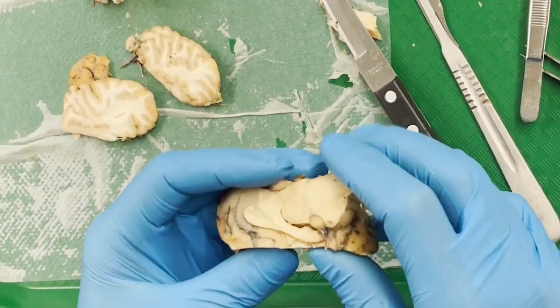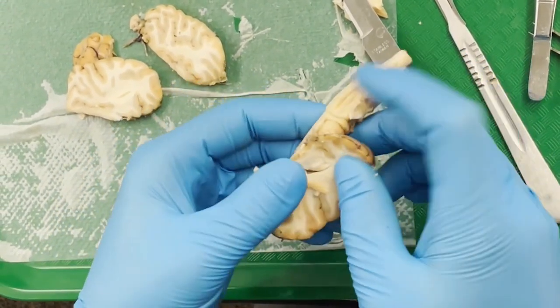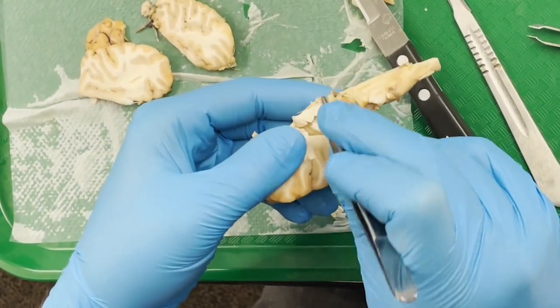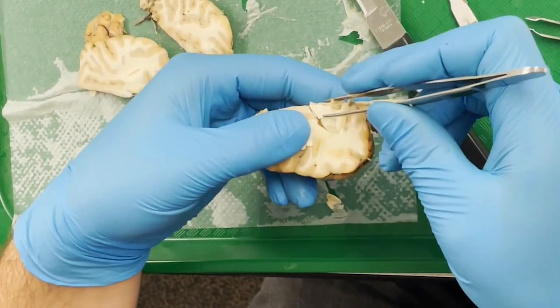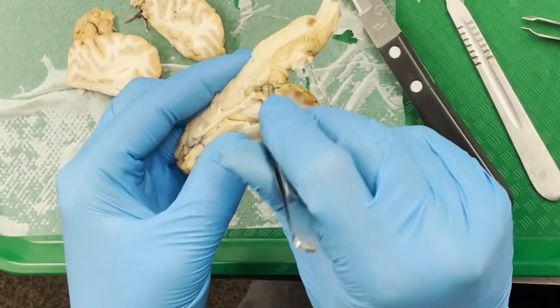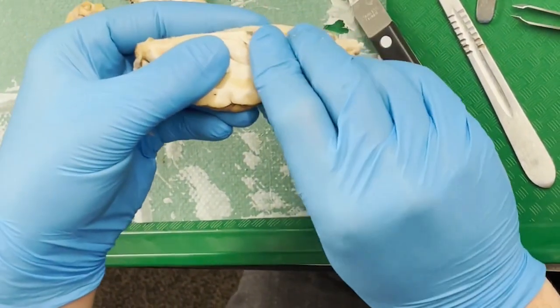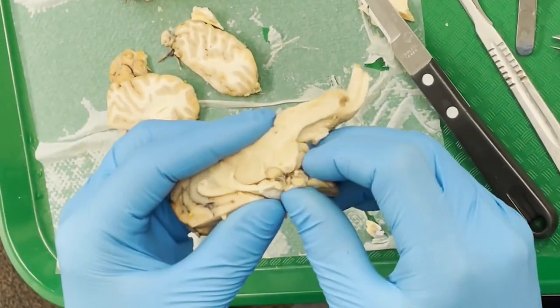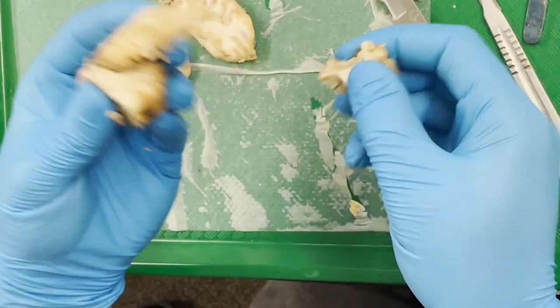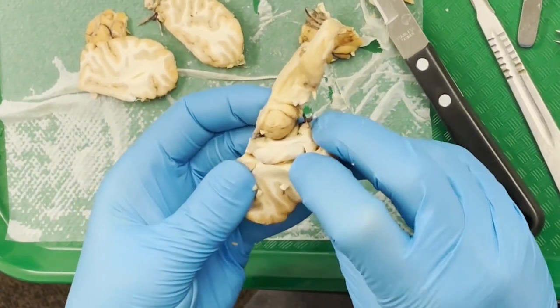Now, extracting this is never the cleanest thing in the world, so I'm gonna try my best to do that. What we need to do is peel off the back of the cerebral cortex. So I'm gonna go into here, pry it open, and just rip this chunk off here. I'm gonna go behind it into the backbone of the hippocampus, and try to follow it down. As I peel this back, you'll see that the crevice keeps going deeper. And as I forcefully rip off the back of the cerebral cortex, this starts to expose the backbone of the hippocampus, which is now this larger bulge that we could see here.